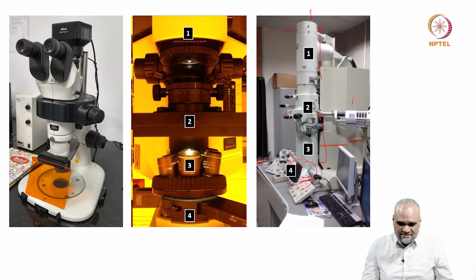So as you can see, first of all, the microscope is built in such a way that you have this columnar construction. The reason why you want to have these columns is electrons, like I was mentioning a short while ago, are charged particles, and you cannot transmit an electron over a large distance, especially these high energy electrons, without deviating too far away from the path of the system if it is done under ambient conditions.